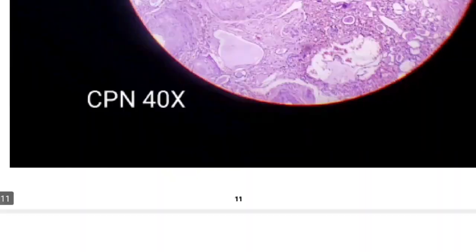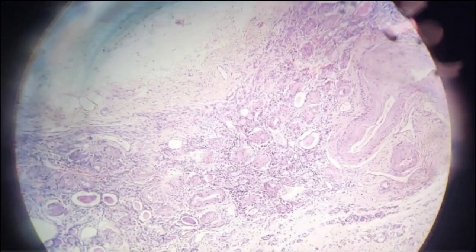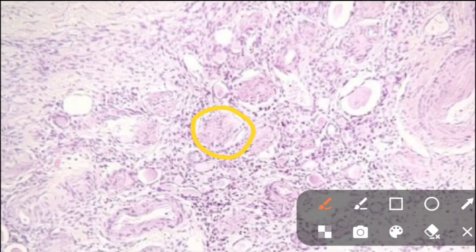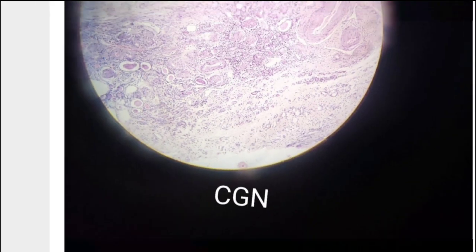Next is chronic glomerulonephritis (CGN). The glomerulus appears acellular and hyalinized — this is the acellular hyalinized glomerulus. Along with that, you can see atrophied tubules, thickened blood vessels, and chronic inflammatory infiltrate. There is also interstitial fibrosis. These are the key features: acellular hyalinized glomerulus, interstitial fibrosis, atrophied tubules, and thickening of blood vessels.